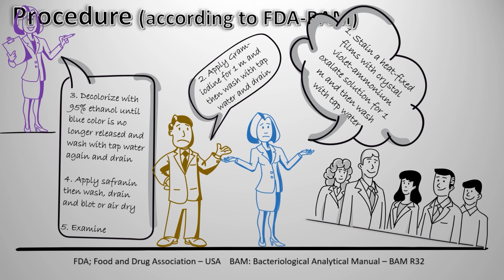Also, you do not need to over-decolorize. Around once or twice washing is quite enough.